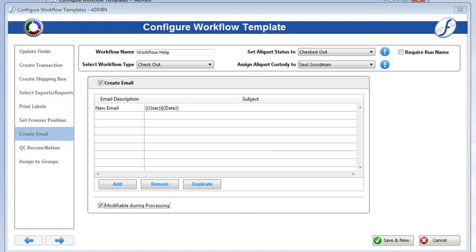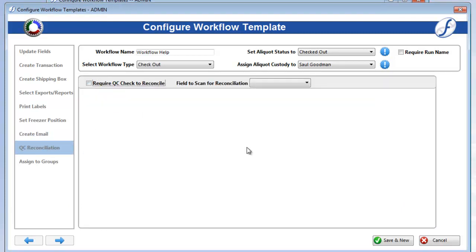The last task you can configure is on the QC Reconciliation page, and it is simpler than all the others. If you want to require users to perform a QC check on the aliquots before they can process the workflow, check on Require QC Check to Reconcile.